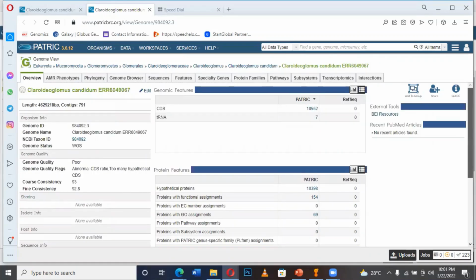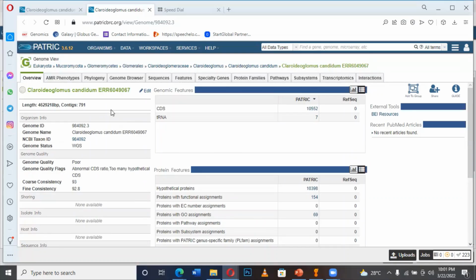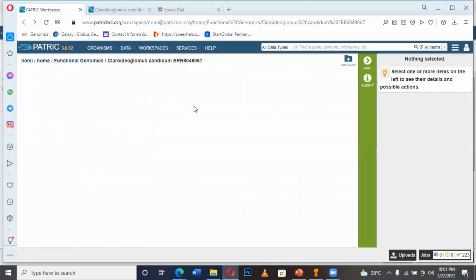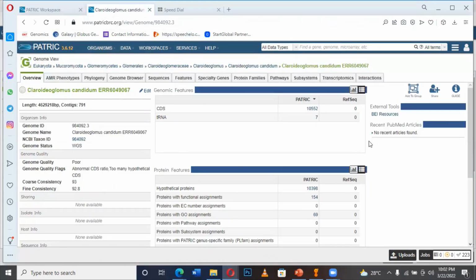And then most importantly, let's try to see the result. Can you see it's the same? The report from clicking the eye icon, and this is the report from clicking the genome ID. All right, so all the same. So let's just go back to the previous page here. We will come back to exploring this deep result.